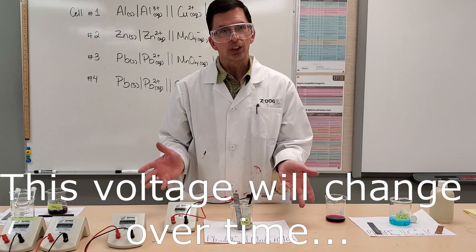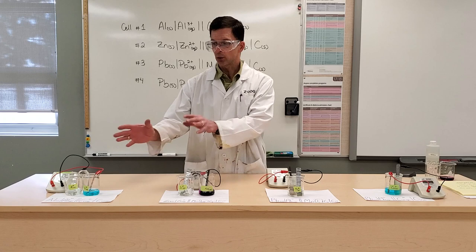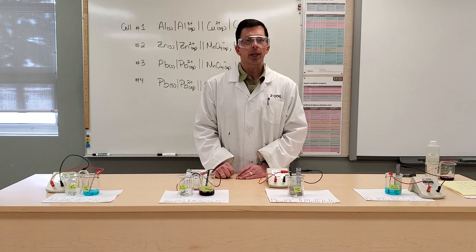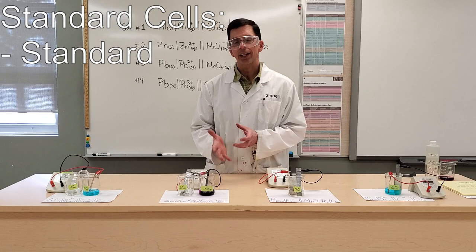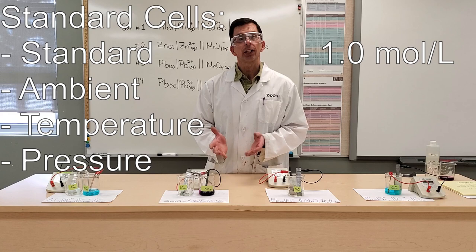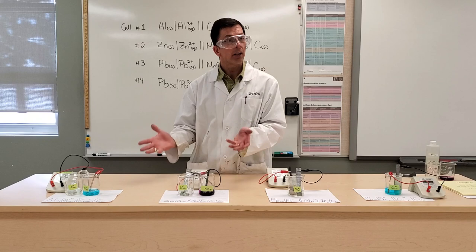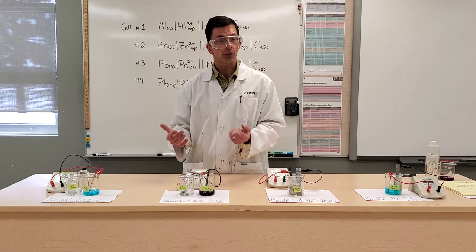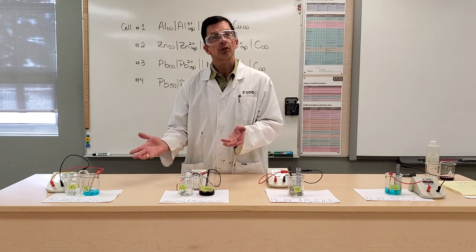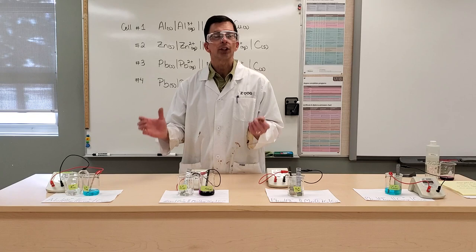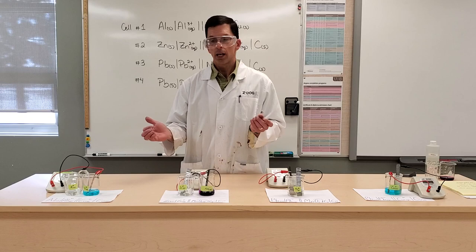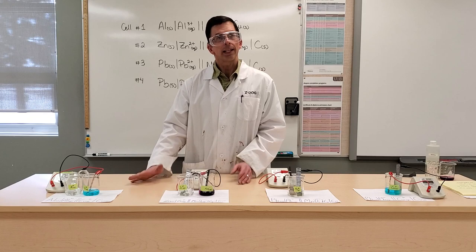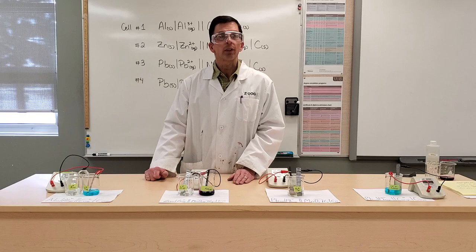Okay, so now we have all four cells set up. We've got two with salt bridges, two with porous cups. And something that we want you to bear in mind is that standard cells are constructed at standard ambient temperature and pressure, along with one mole per liter electrolyte concentration. Now, we don't have that here. It's very expensive, and it's very wasteful, costly to the environment to construct one mole per liter solutions. So our electrolyte concentrations are 0.2 moles per liter. So please bear that in mind when you're looking at your data book, page 7, that's all based on one mole per liter concentrations and standard temperature and pressure. Next, we're going to show you close-ups of each cell and the net cell potential that we've measured.